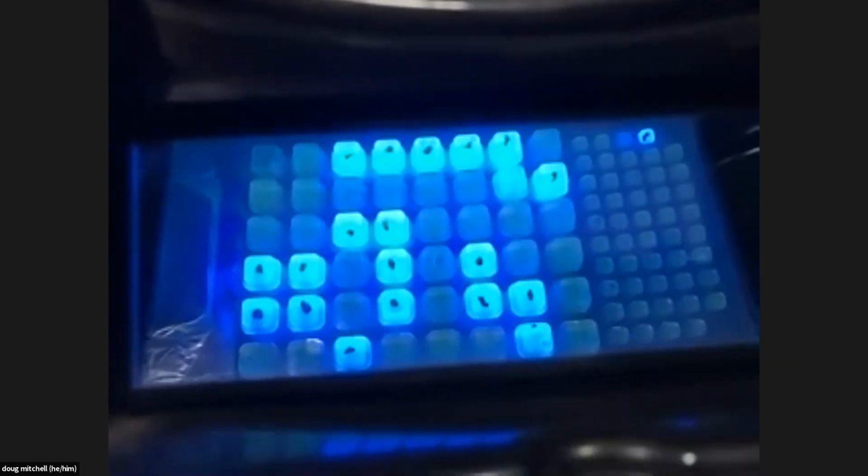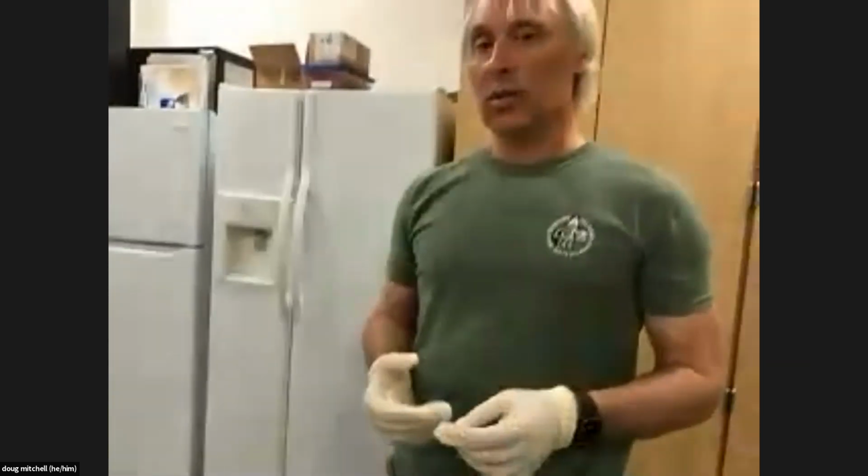So you want to show this tray? What we do is we find the number of large wells and we run down. That was 19, and then 1 small well. So 24.6 on the most probable number table, and then multiply that by 10. So that is 246 for a reading.